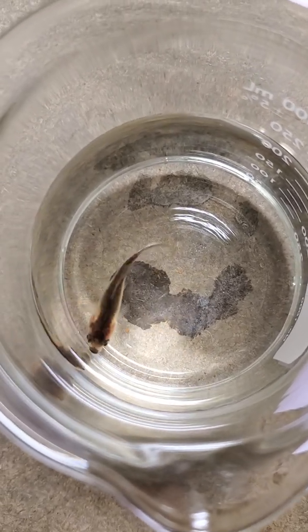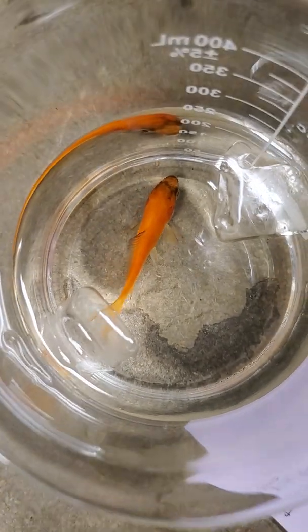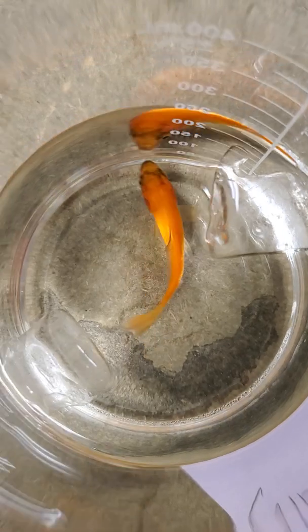And time. And we're going to move on to our experimental. It is 13.5 degrees Celsius is the temperature. And start.